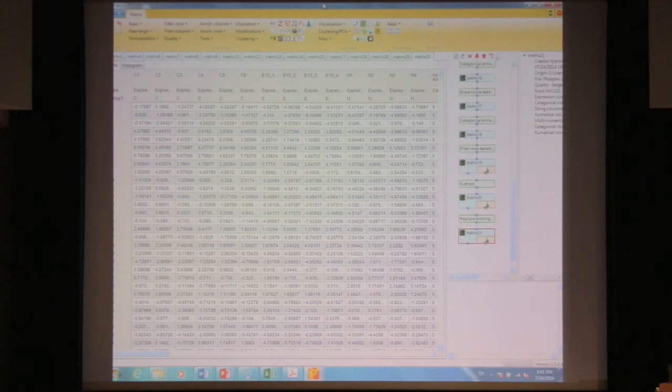If we were to do this again and again on the same matrix, would we get slightly different values? Is there a random seed then? Yes. If I can just pitch in, because we've discussed this a lot internally, I frankly don't think there is really a right way to do it always.